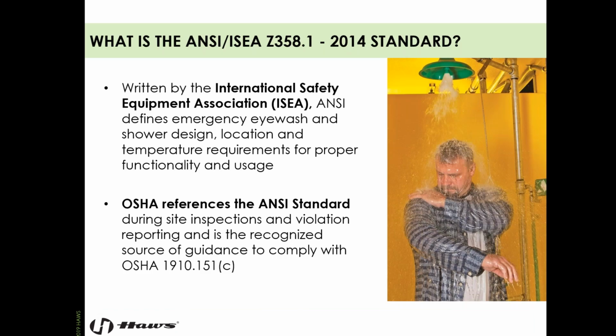Now, the standard was actually written by the ISEA. If you're not familiar with them, they're the International Safety Equipment Association. ANSI is basically the distributor of that standard. So ISEA wrote it, and the standard itself defines emergency eyewash and shower design, location, and temperature requirements for proper functionality and usage. It's the most widely referenced standard in the world for eyewashes and safety showers.